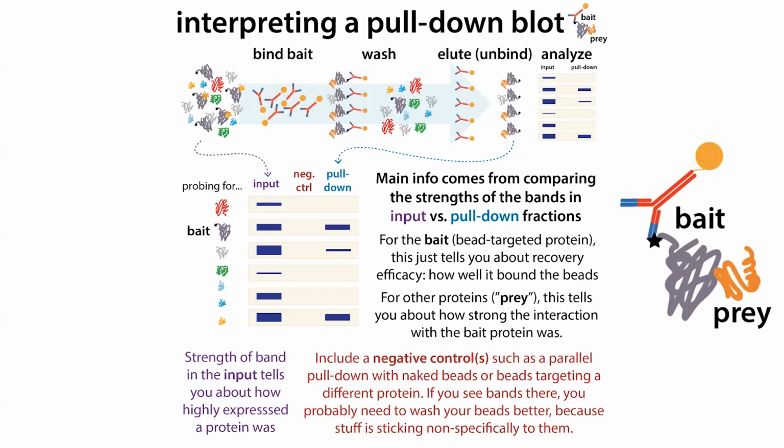This can work either way, where you're introducing false interactions, or you could be losing interactions because now you're lowering the concentration of the protein around that original thing. And so sometimes the interactions that you detect aren't actually interactions that you see inside of cells, or you're missing interactions that you see inside of cells, but you're not seeing here.